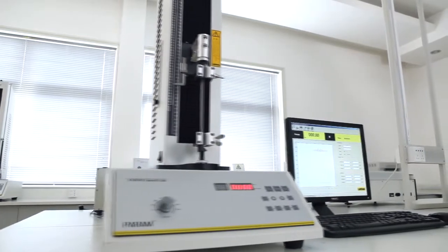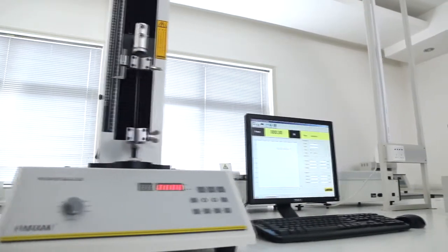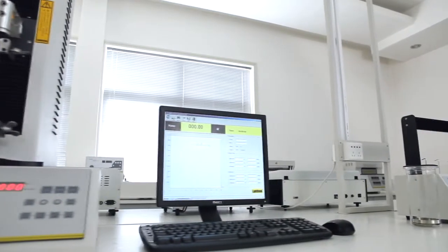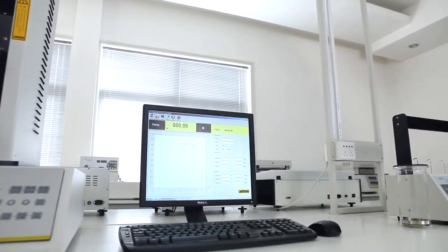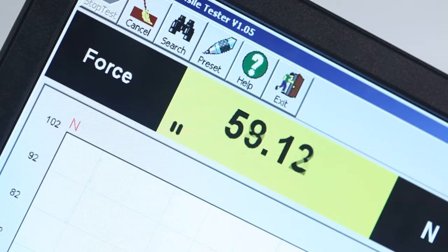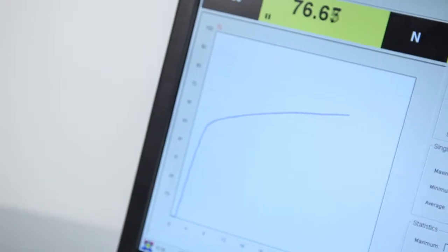The testing software designed by LabThink has an intuitive operation interface as well as a visual display of real-time data and graphs.